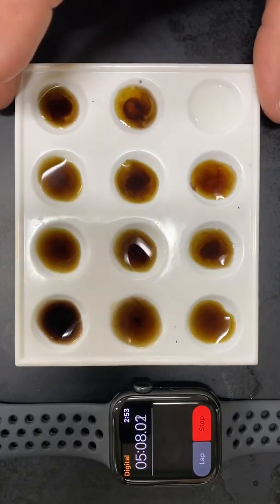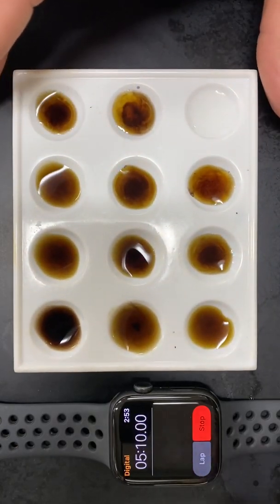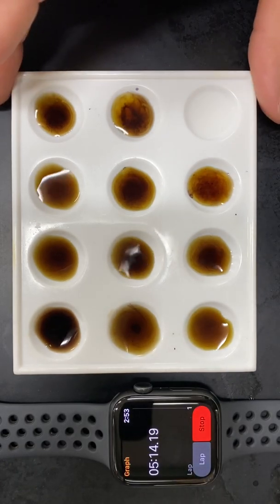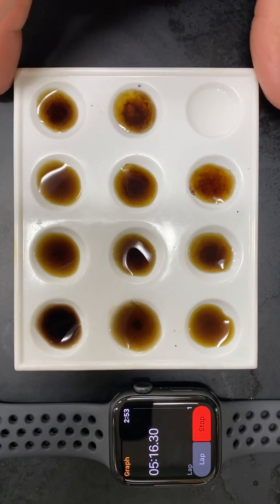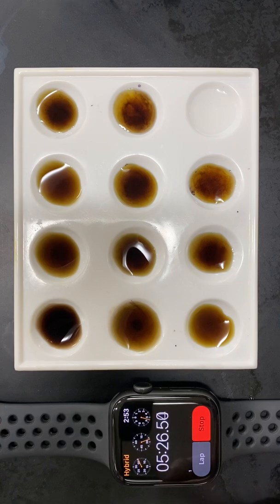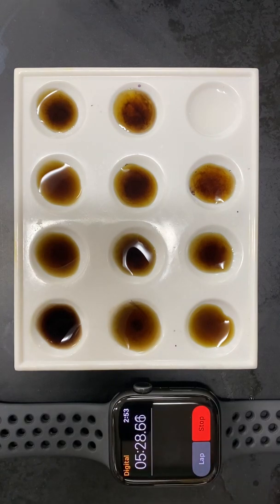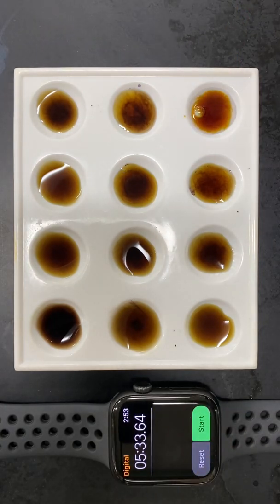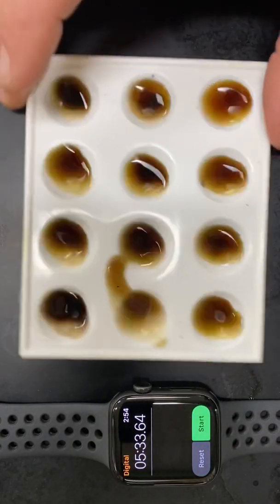And what it looks like to me is that it is definitely starting to lighten up. It's definitely starting to lighten up at this point. So I'm going to do one more. And we'll stop.